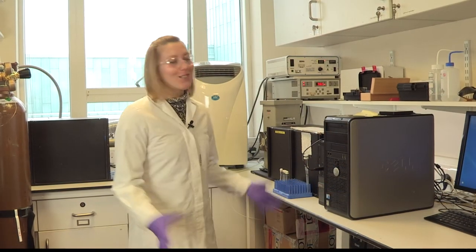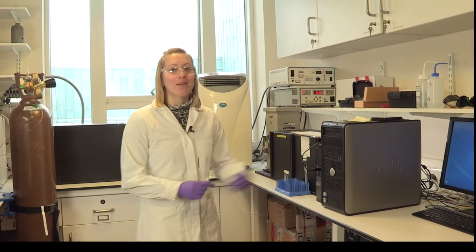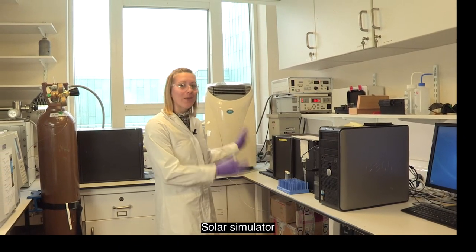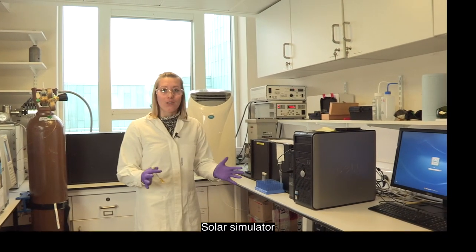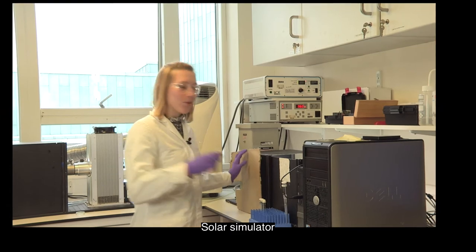What we're going to be doing here is putting our samples in the sunlight. We can't just stick them outdoors because we live in England and there is no sunshine. So we use something called a solar simulator, which uses the exact same spectrum as you'd get outside — it's just always there and always consistent. I'm just going to put a few different samples in here.